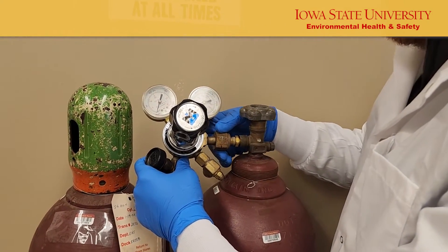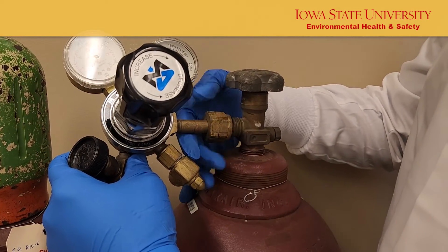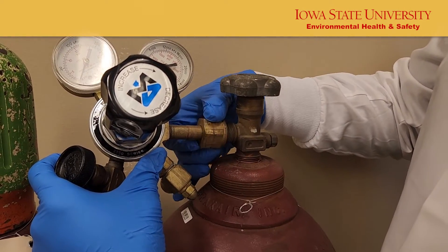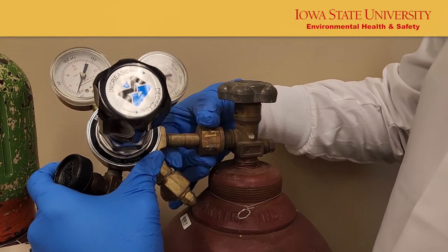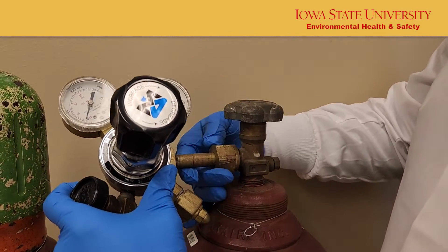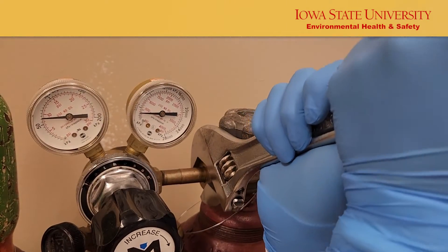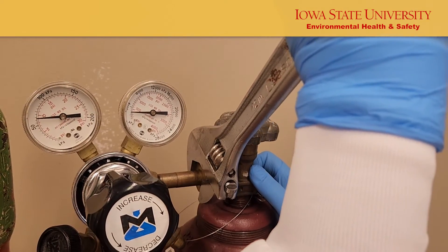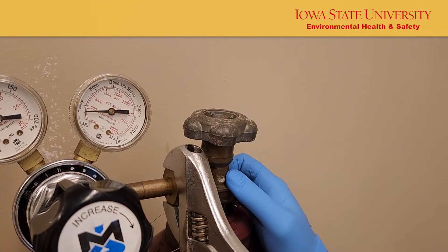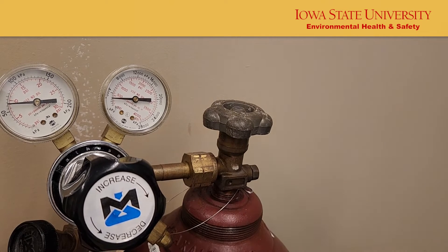Thread the regulator into the cylinder. When attaching the regulator, do not stand in line with the regulator and valve outlet. If the regulator will not fit into the cylinder, this indicates that the incorrect regulator is being used. Tighten first by hand and then use a smooth-jawed wrench. Do not over-tighten the fitting — most fittings are brass and can be easily warped. For flammable or oxidizing gases, ensure your tools are non-sparking.